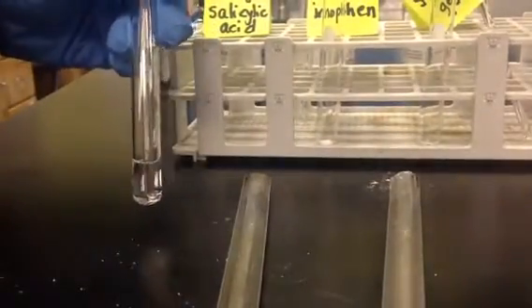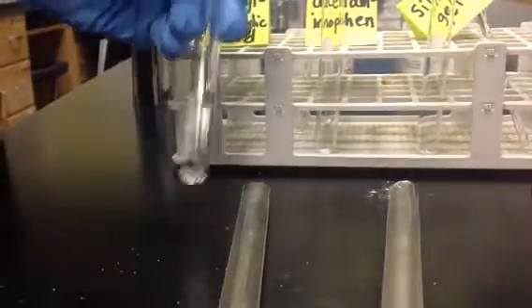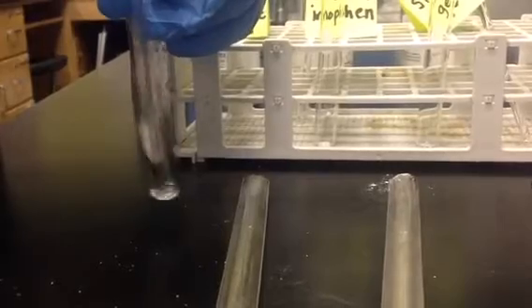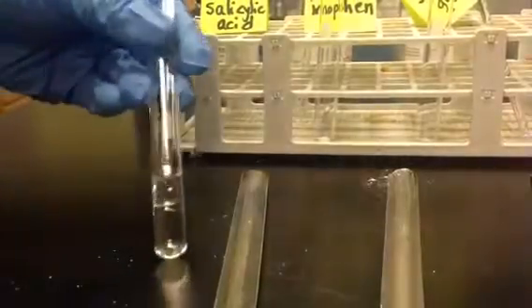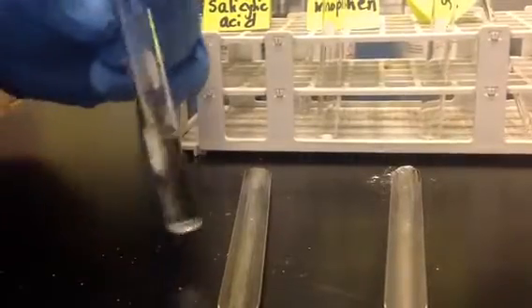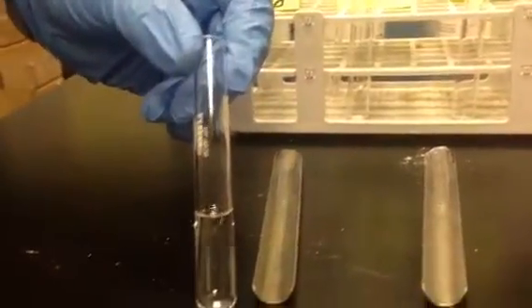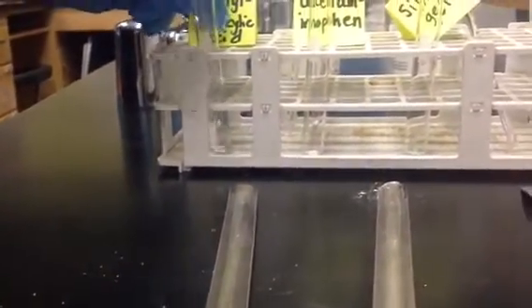So I'm going to add another milliliter and see if I can finish dissolving it. And again, stir vigorously. Can you see that it's gone? It's dissolved it. So definitely acetylsalicylic acid is soluble in the ethyl acetate. Okay, so it's definitely dissolved. That's a good thing to know.